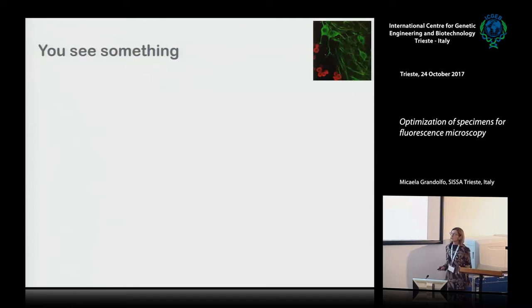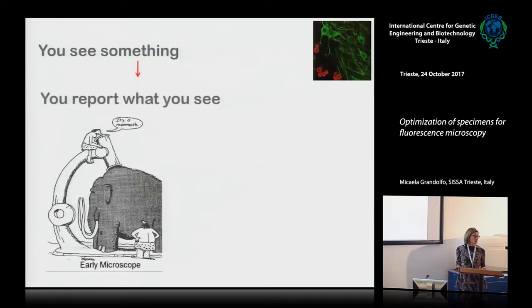When you go to a microscope, you see something and you report what you see, okay? But the question is, seeing is believing. It seems a very trivial question, I understand that this is the point. But remember that an insufficient understanding of your experimental manipulation leads every time to an introduction of errors and artifacts in the final images that you will take using your microscope. So I think it is not so trivial, this question.